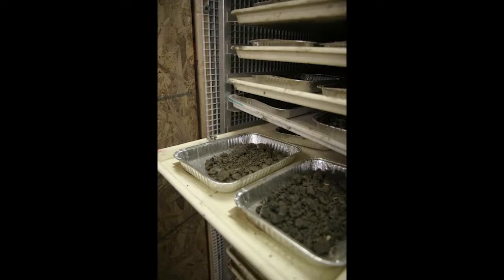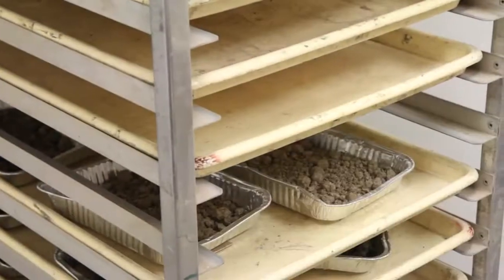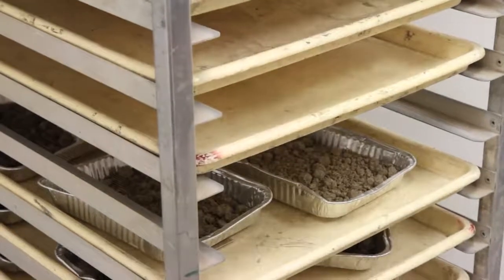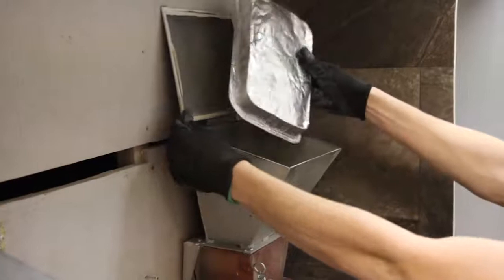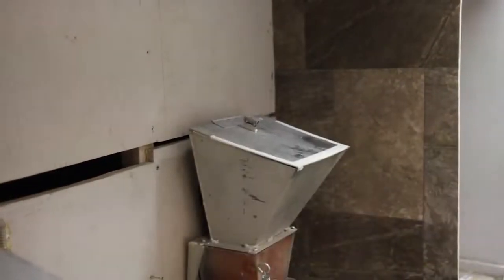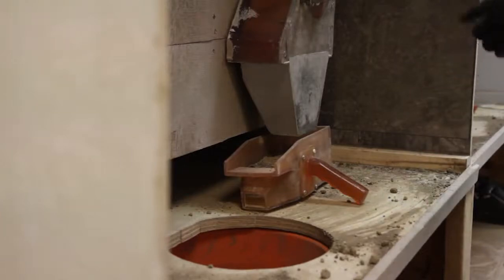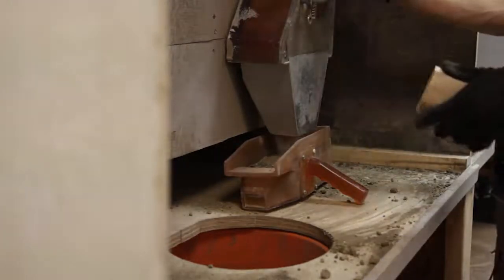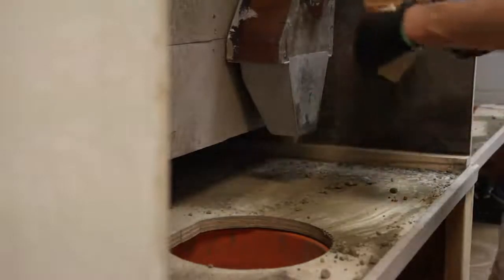In the afternoon, after the samples have dried, sample grinding begins on the samples received that morning. Carts of dry soil are taken from the drying room and are ground in a flail mill. Grinding the samples performs two functions. The soil sample cores are broken down into a fine powder in the soil mill, and the mill also homogenizes the soil sample. The final step in grinding the soil sample is to sieve out any stones or straw and transfer the ground soil into a lab container.